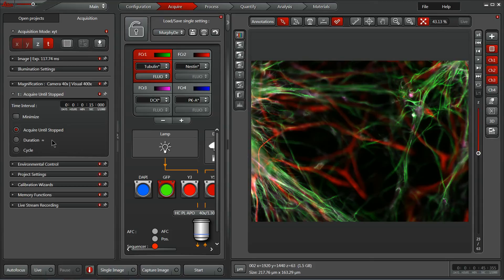Once you have the experiment set up the way you'd like, simply click the start button and it will capture those time points with all the channels that you've got indicated here in the center panel.